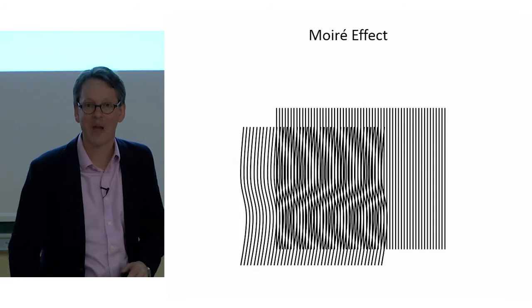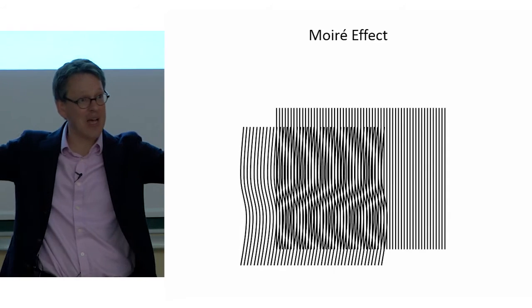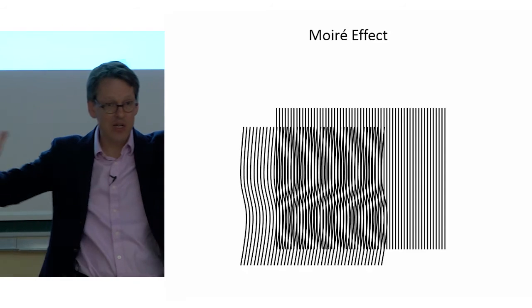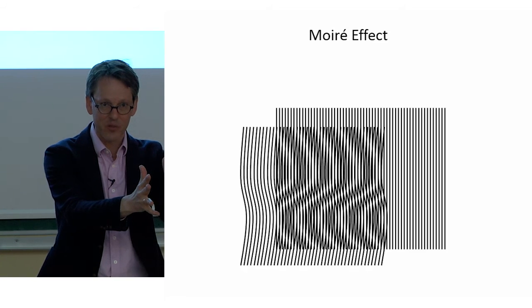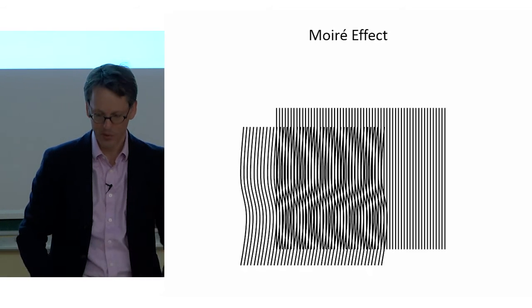Same thing happens in the microscope. Right? It's an imperfect system, and some of the information doesn't go through the microscope anymore. So how can we recover this information? Well, I have to shift some of that high frequency information into lower frequency information and then pass it through the microscope. Is that doable?